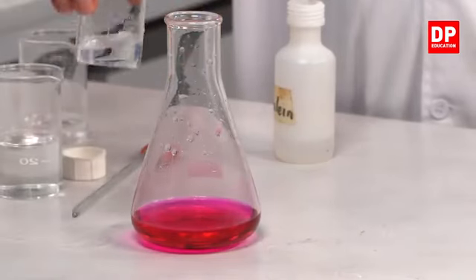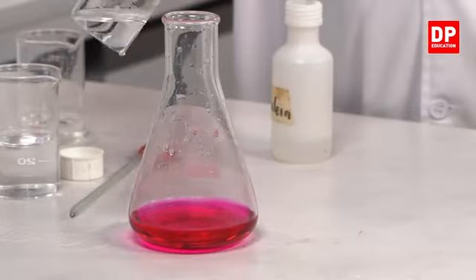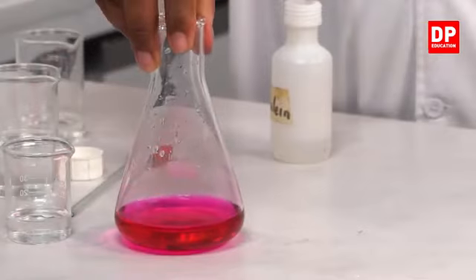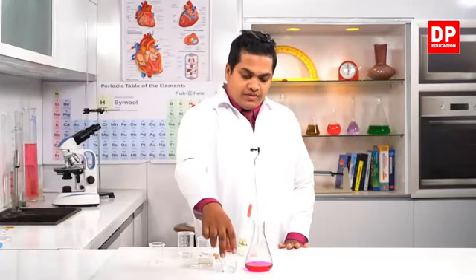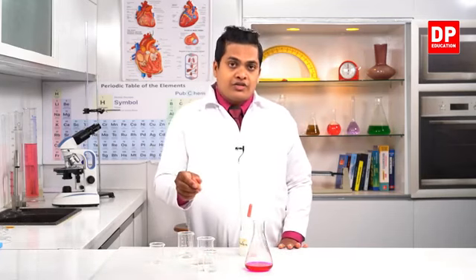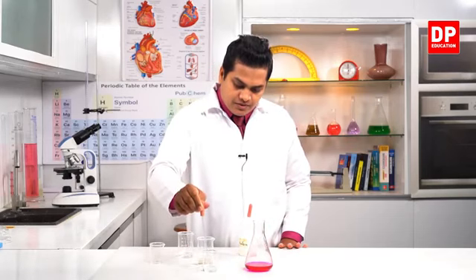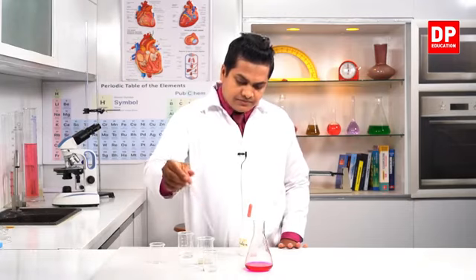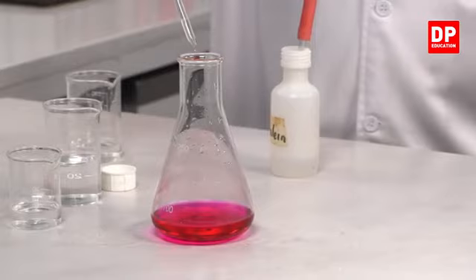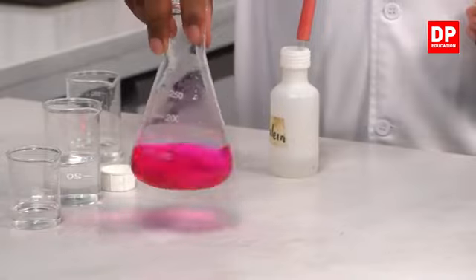Right, just 1 drop once again. Right, now it's difficult to add using this smaller beaker, so therefore I'll use the dropper. So let's take some amount of HCl, right. You can see the color is disappearing gradually.